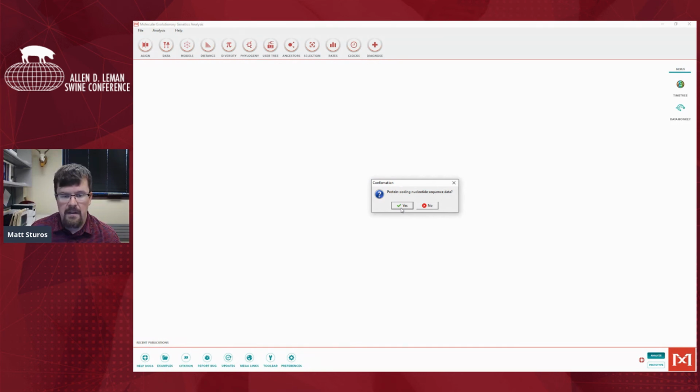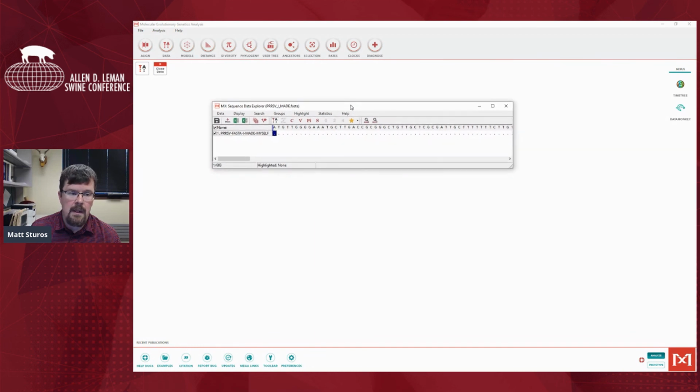So you would say it's just the base translation or there's some specific. So I just typically click no. And then you're like, well, I opened it. Where did it go? The important part here in order to see what you opened is to click on this TA button here. This is going to open your data file. It might be in a different screen like mine was.